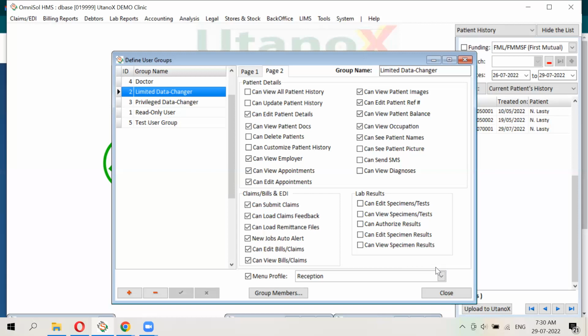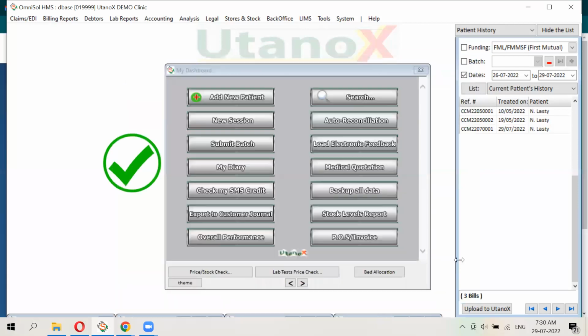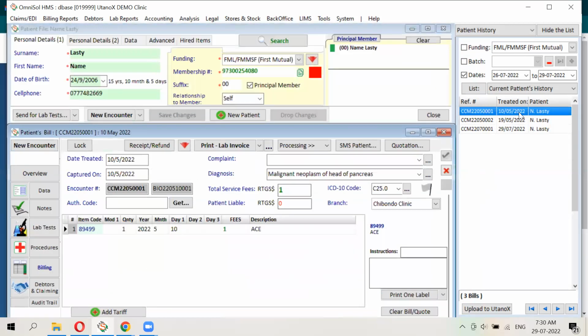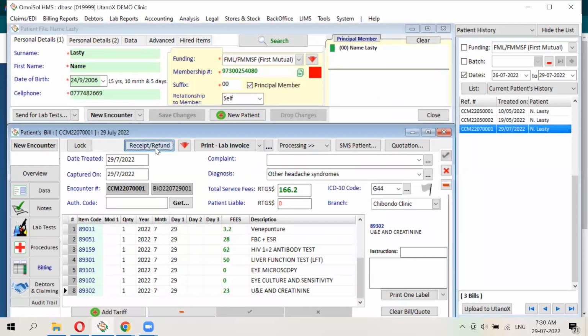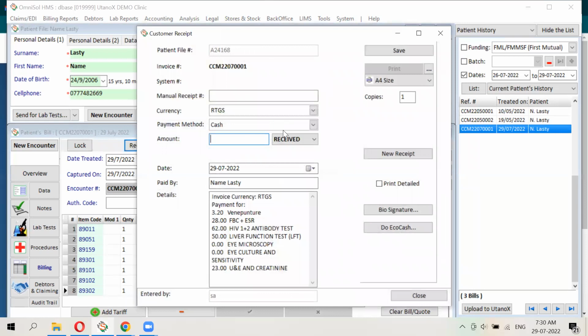Okay. Then the other thing would be on the accounting side. We are talking of a scenario where I have billed the patient who is there. I told them they owe me 5 pula. They pay that 5 pula. Can I record that payment onto the platform? So that I know this patient doesn't owe me anything. Yes, you actually can receipt the patient in the system. This is the receipting, and even print the receipts as well.